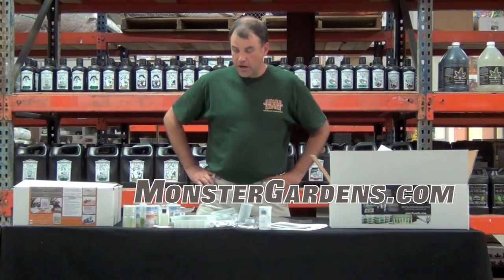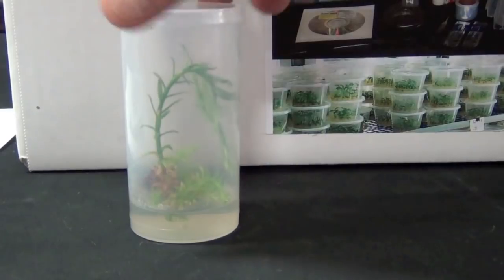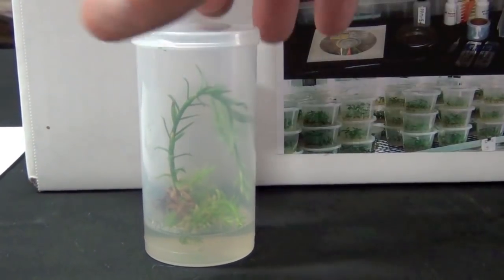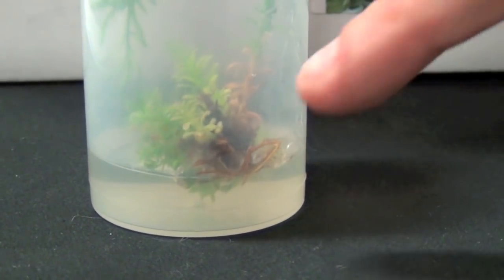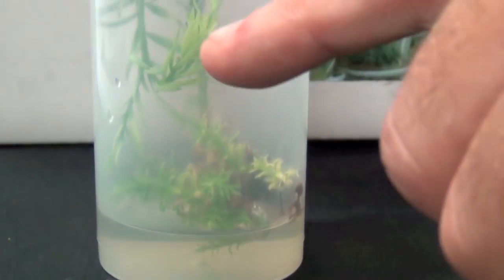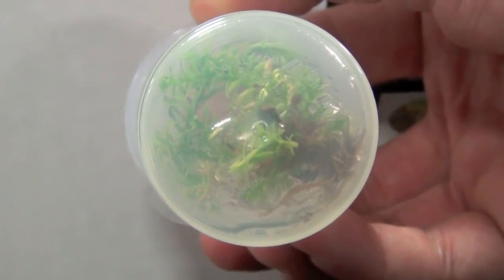So those are the contents of the MicroClone plant tissue culture kit. Redwood is really one of the easiest plants to put in culture. You think that redwood grows from burl, and what we're really doing is we're culturing burl. That little lump down there at the bottom started as a piece of redwood leaf. I started with a tip like that, and as it got bigger, it got burl-like and you can see the new plants coming out of it. There's a small new plant in the center, a little bigger one, and over to the side are three or four new ones. The great big one has grown and turned up at the top and branched — it's actually grown and turned upside down. If you lift this up, you can tell it's grown into probably ten or twelve new plants.